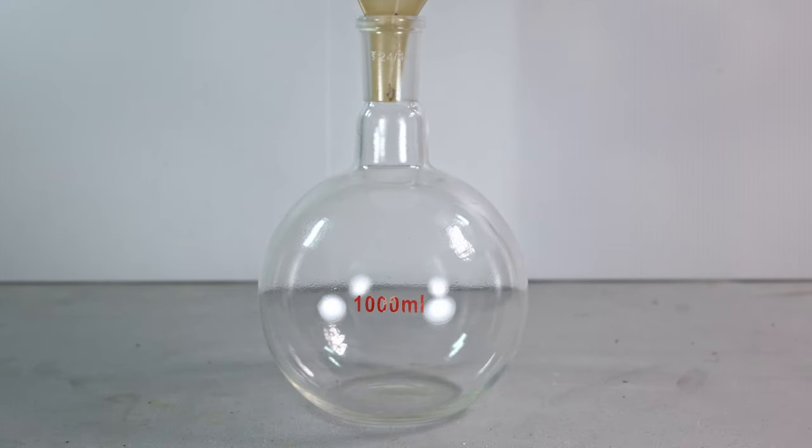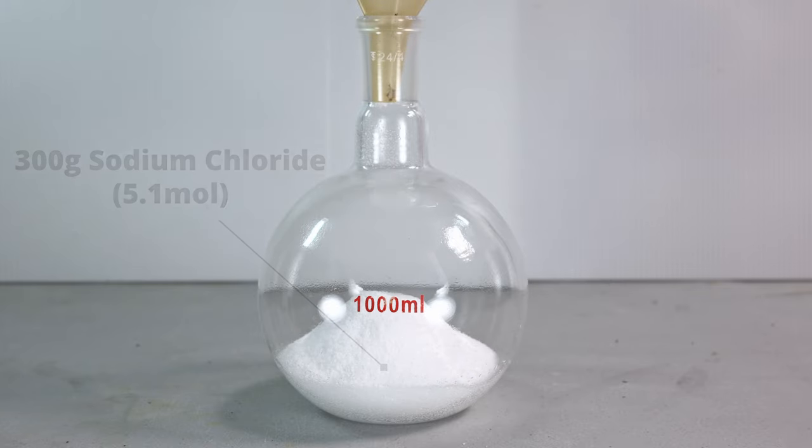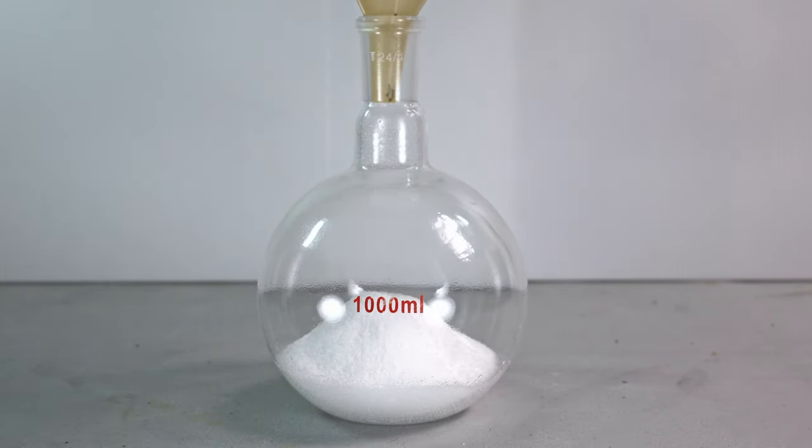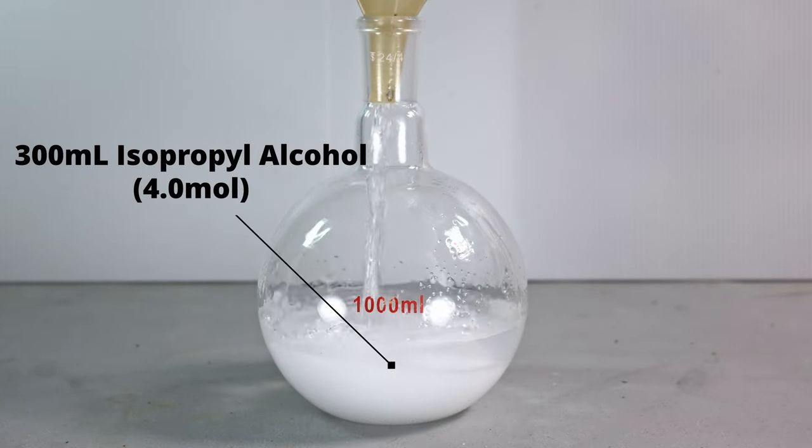The first thing we're going to do is add in 300 grams of sodium chloride salt. This is a little more than 5 moles of sodium chloride. Now I'm going to pour in 300 milliliters of 91% isopropyl alcohol. This equates to roughly 4 moles of alcohol.